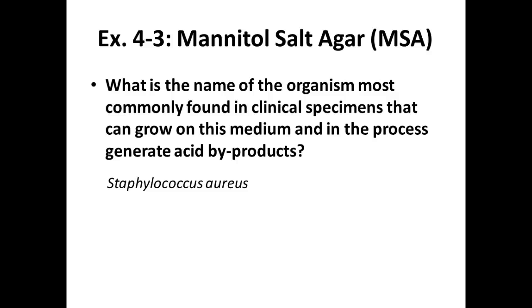So look at that plate, and you should be able to see the two different staphs that I put on the sample plate for you guys. The Staph aureus should be standing out at you because what color is the plate? Yellow. Where the other one you see growth, but did it change the color of the plate?